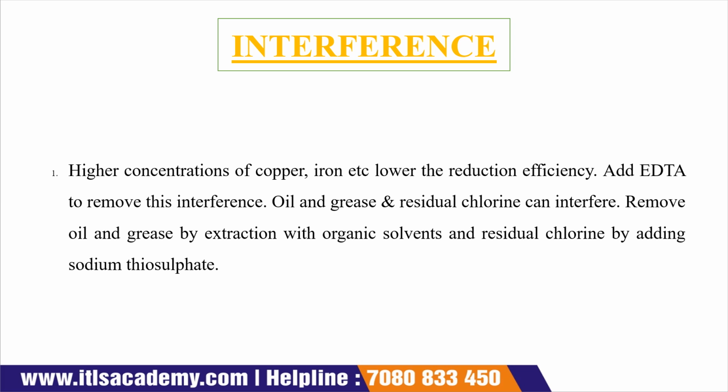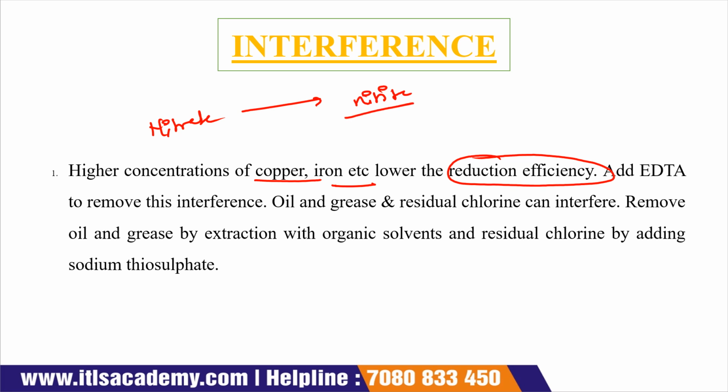If there is a high concentration of copper, iron, etc., then it will lower the reduction efficiency. We all know that nitrate reduces into nitrite.